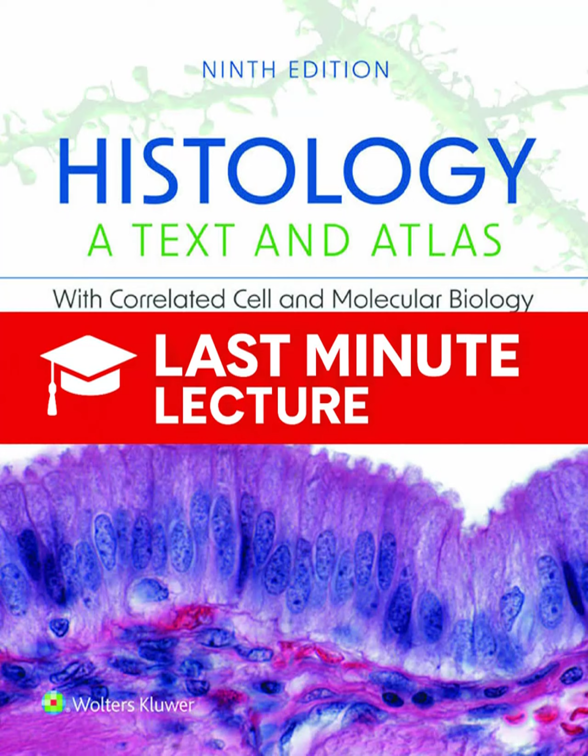Now, for a really remarkable technique, Atomic Force Microscopy, or AFM. It's not optical, it's not electron-based, and yet it gets molecular or even atomic resolution, and it doesn't need a vacuum. The AFM works literally like a fingertip tracing a surface. It uses an ultra-sharp probe on a highly flexible cantilever to scan the specimen, reading the tiny atomic forces on the surface. And how is that physical movement turned into a picture?